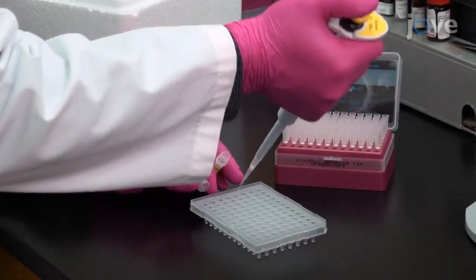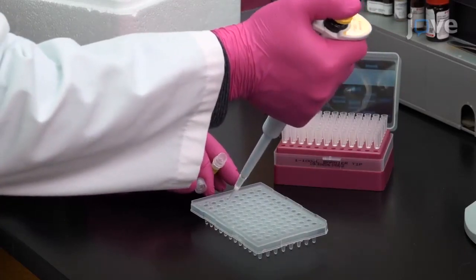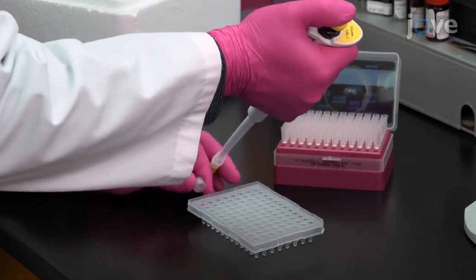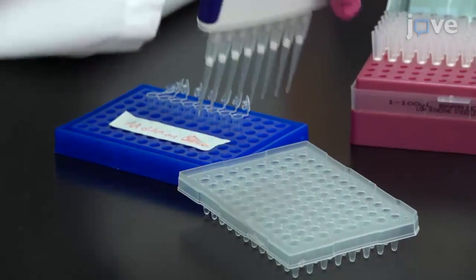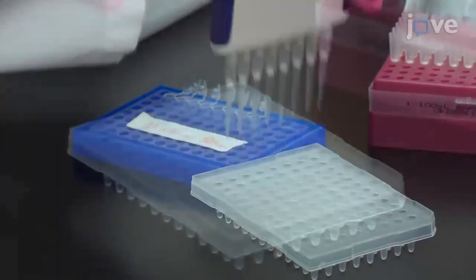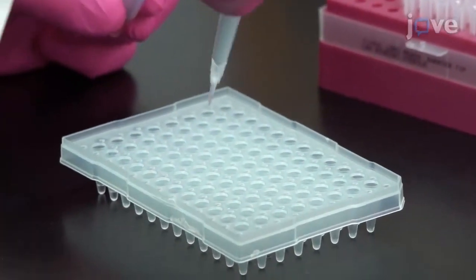Prepare reactions for digital PCR in duplicate according to the manufacturer's recommendations for using a digital PCR supermix designed for probe-based chemistry. Use the pooled genomic DNA as template DNA. Also add the 20X primer probe master mix as described in the text protocol.